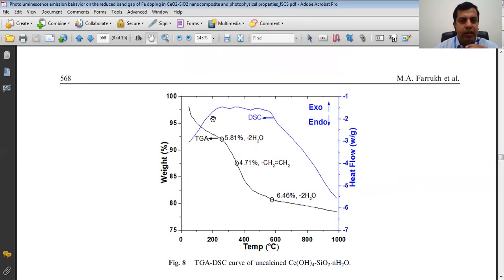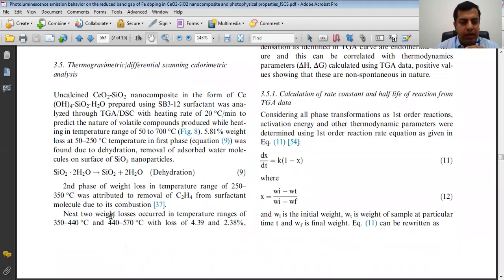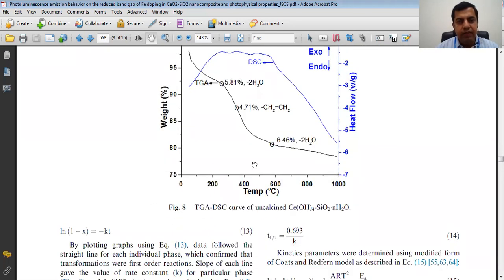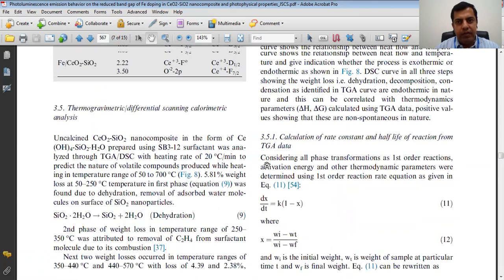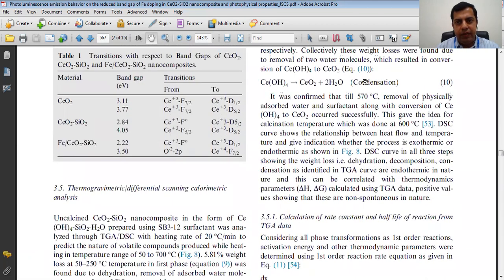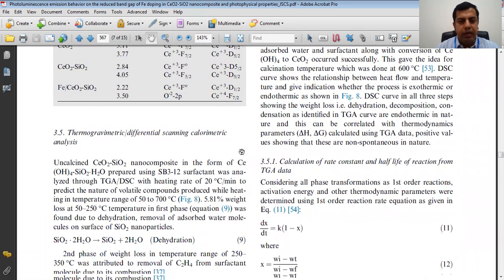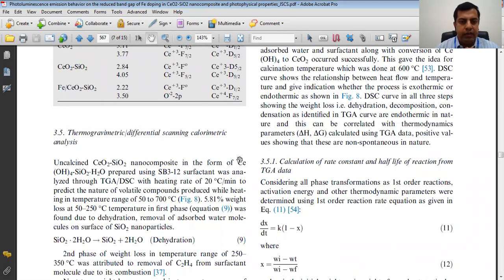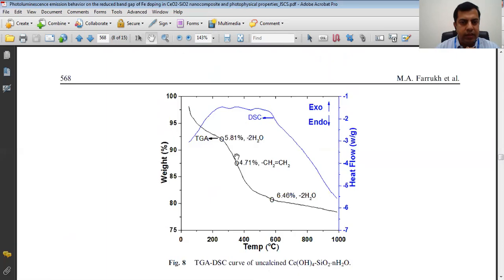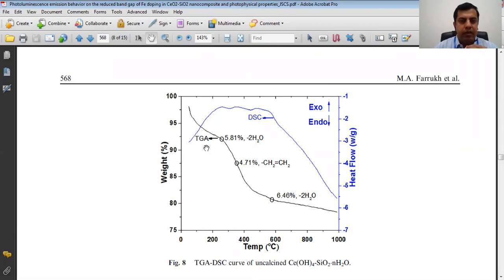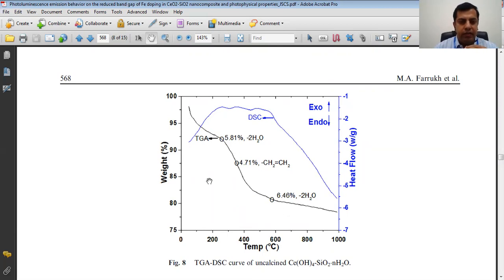The first stage is called dehydration, the second one is combustion, and the third one is the condensation process, as explained in this paper. I will calculate the thermodynamic parameters — activation energy, change in enthalpy, change in Gibbs free energy, and change in entropy — for all three phases.